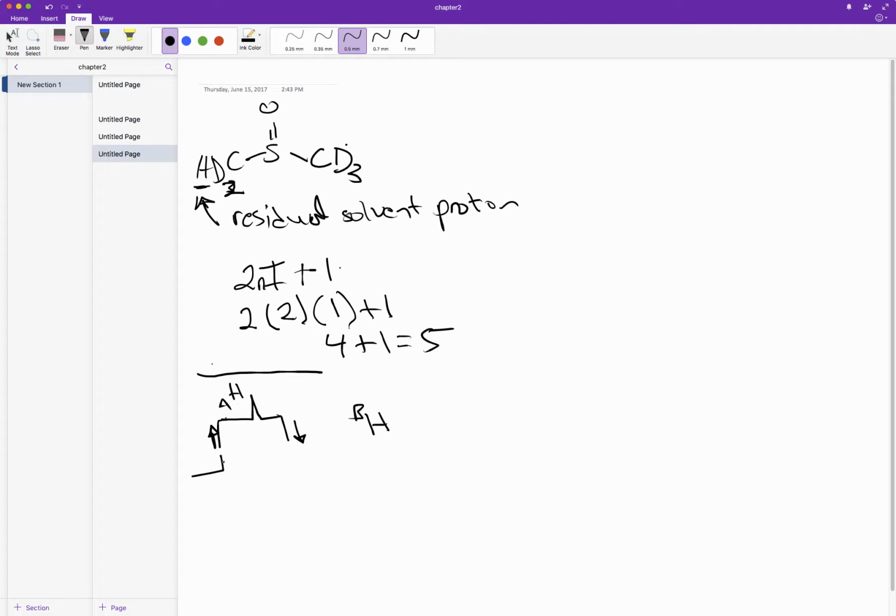So you'll have a peak here and a peak here. This is still at the same chemical shift, but this one will be minus a half J coupling, and this will be plus a half J coupling away, so the distance will be J apart for these 2 peaks. And then if you added in another coupling partner, you would have something like this.